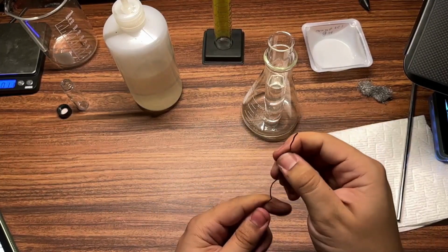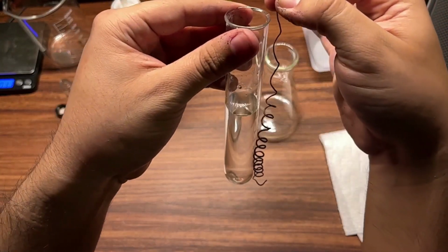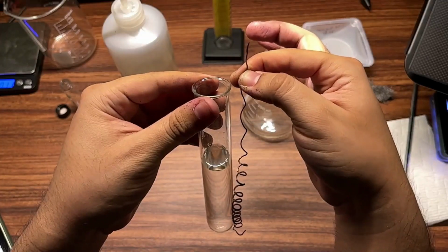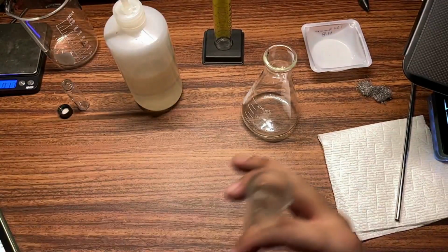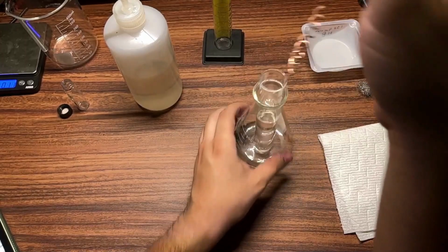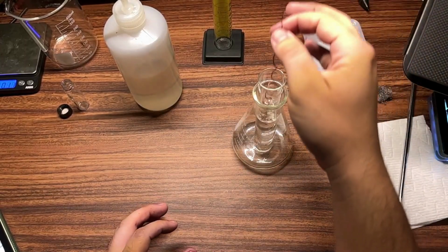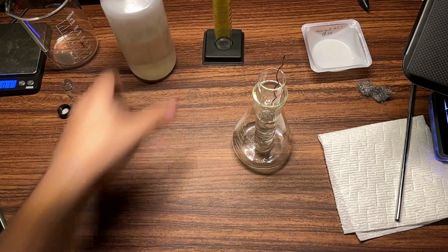I'm going to stretch it like the instructions say so that it's just a little bit longer than my test tube, because I want it to stick out so I can grab it easily. And that's pretty much it, right? I just need to plop it in there and get the reaction going. So here we go. I'm going to change the camera for you so you can see a little bit better.